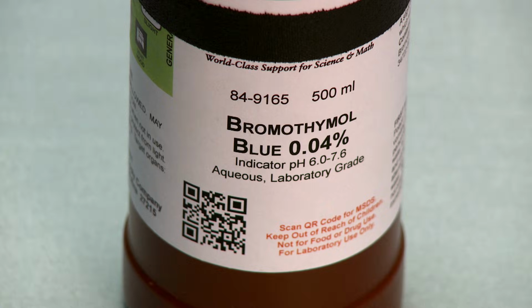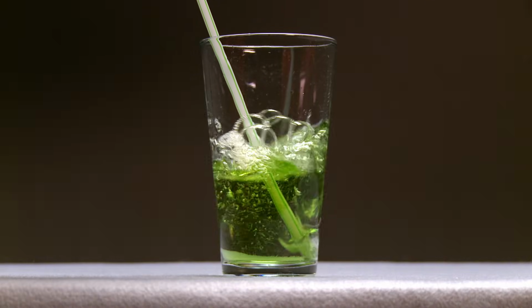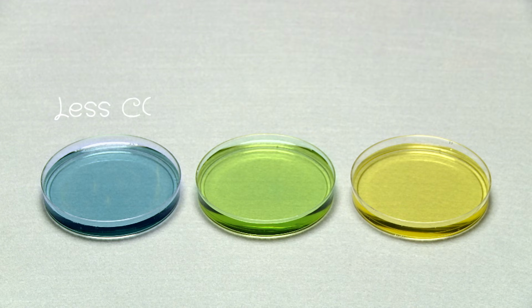BTB is bromothymol blue. BTB changes color when carbon dioxide is added, like when you blow bubbles into it. We can use BTB to see if carbon dioxide concentrations increase in the air.